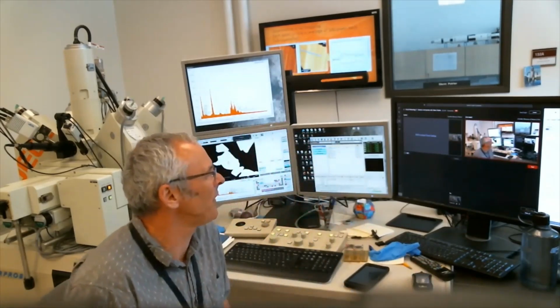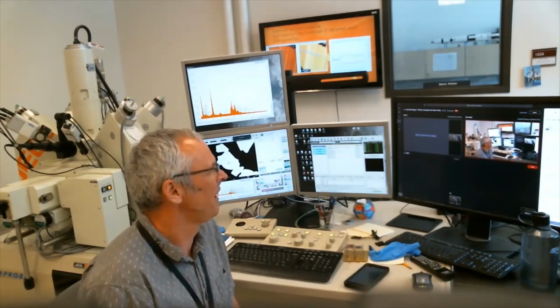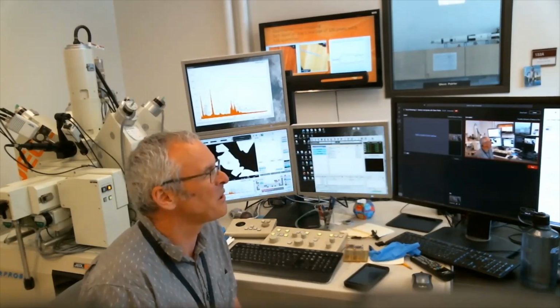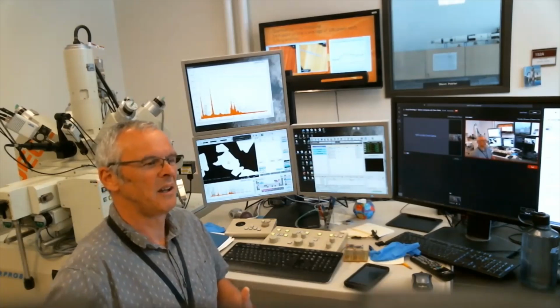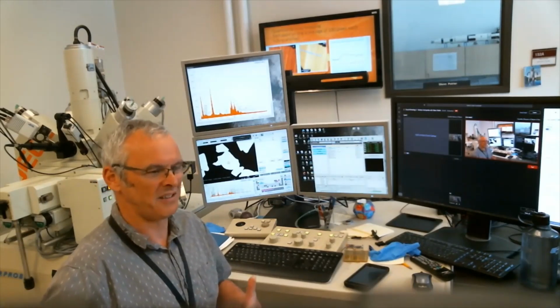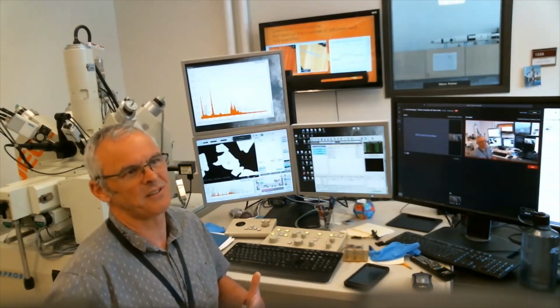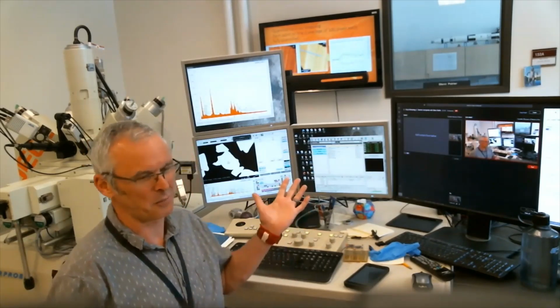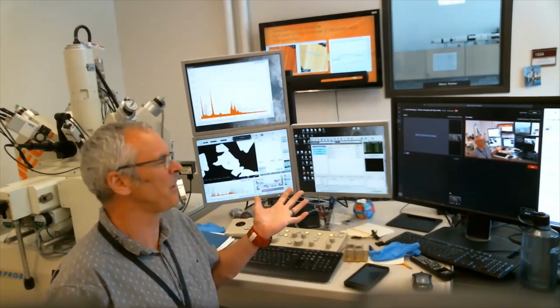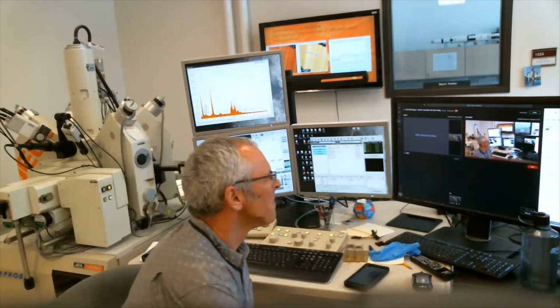Carl asked how often elements and devices have to be replaced. I'm not quite sure what you mean by that, Carl. The filaments are about the only items in the machines that have to be replaced. The electron sources need to be replaced. It depends on the machine. For the SEM, every 40, 50 hours. For the microprobe, with better vacuum, every 3,000 hours. I hope that's what you mean.